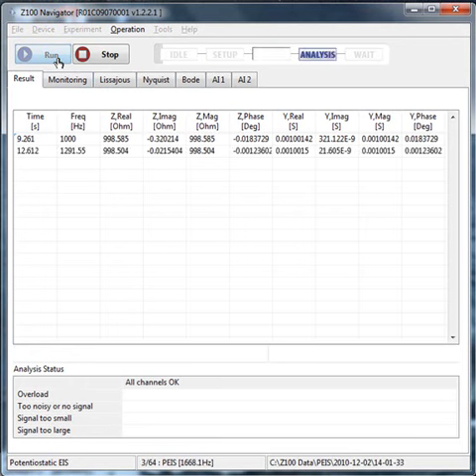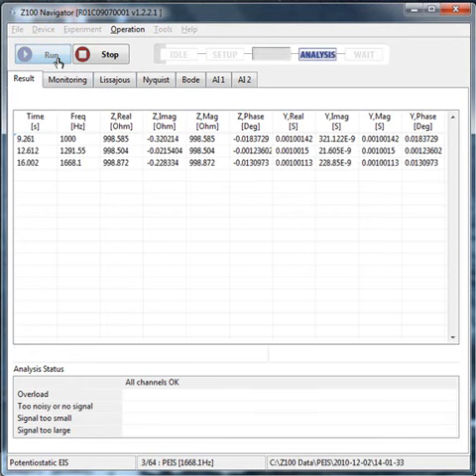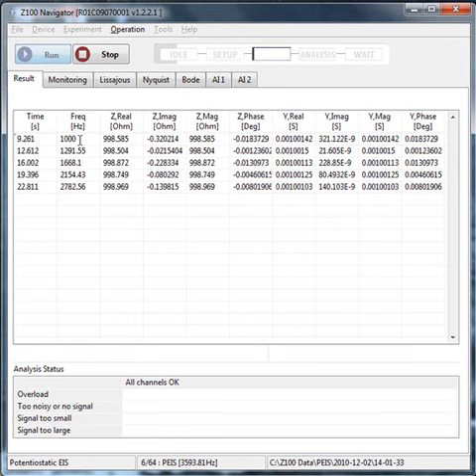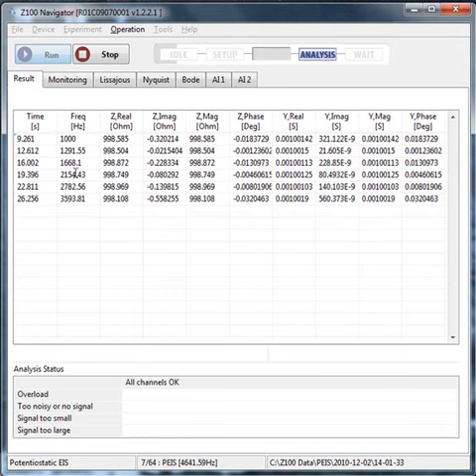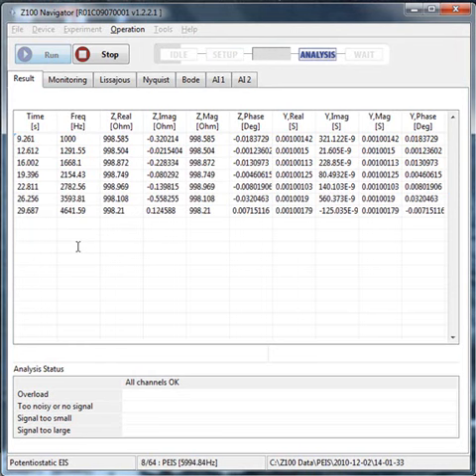Once it's found the appropriate settings, it starts testing the internal resistor and generates a result one at a time. It starts at the initial frequency here and will go through to the final frequency, which can take a few minutes to complete.